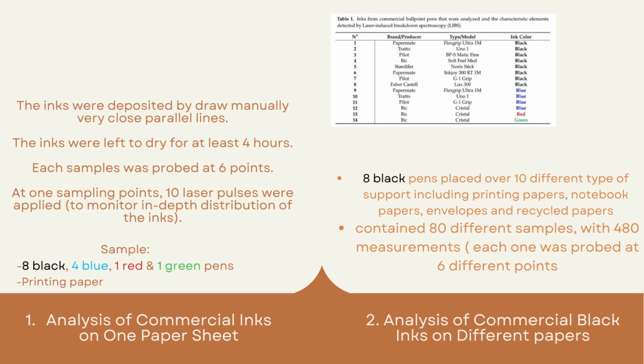Each of the 14 samples was probed at 6 points, each at a distance of at least 1.2 millimeters, in order to exclude the area affected by the laser-induced shock wave and also the eventual redeposition of material ablated from nearby examined points.